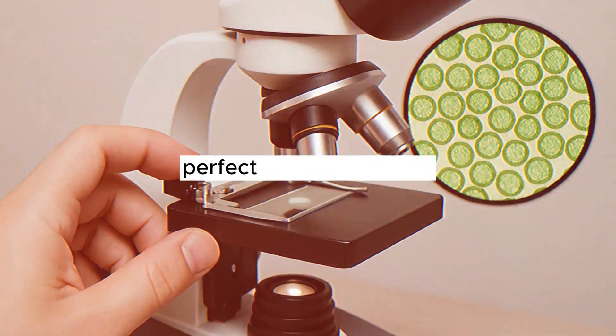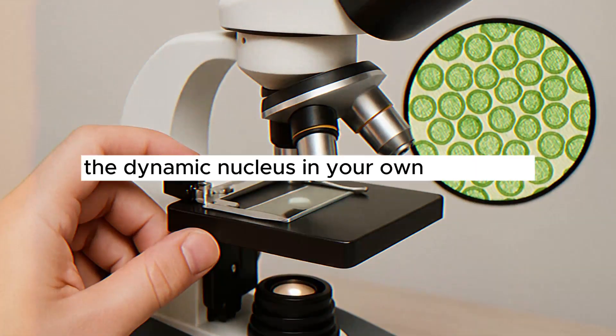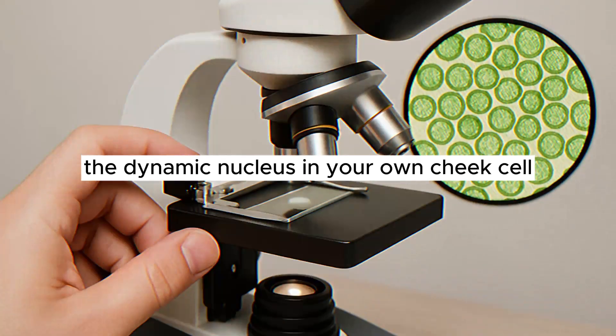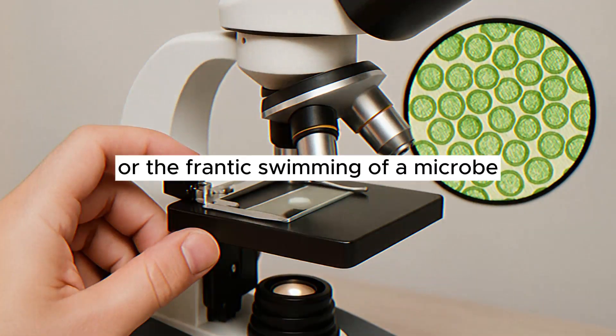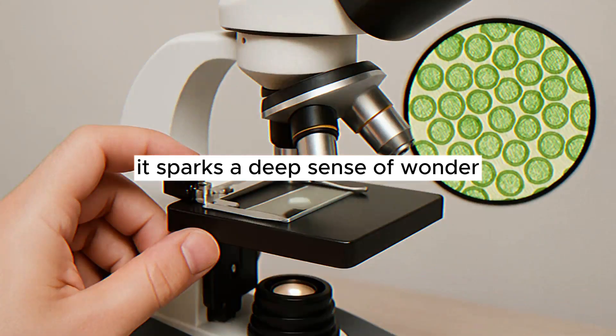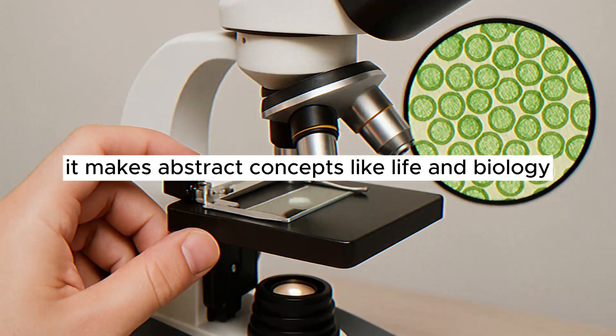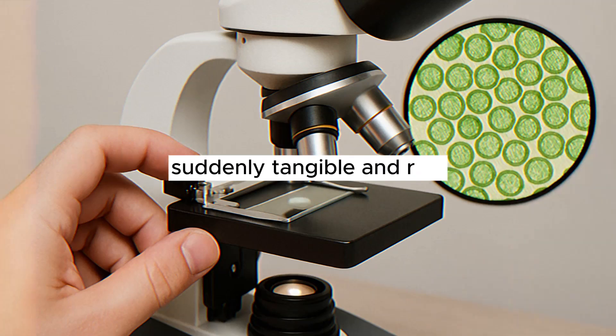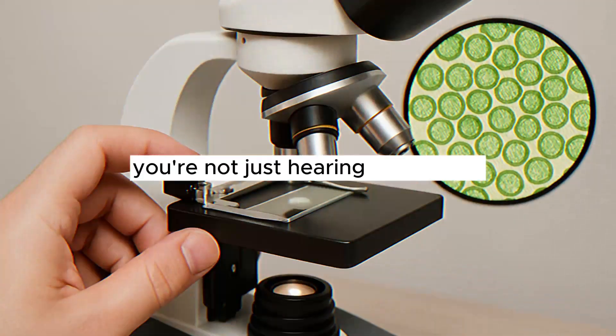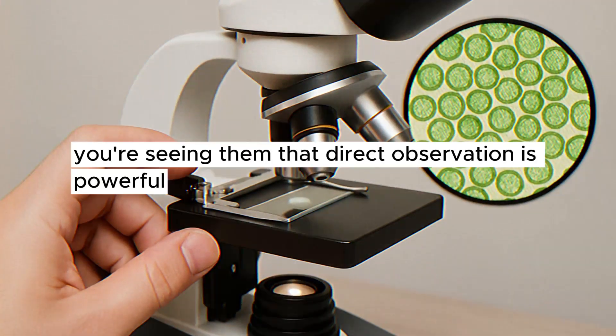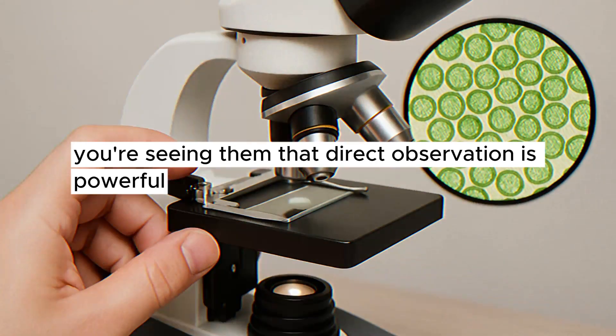Whether you're looking at the geometric perfection of a plant cell, the dynamic nucleus in your own cheek cell, or the frantic swimming of a microbe, it sparks a deep sense of wonder. It makes abstract concepts like life and biology suddenly tangible and real. You're not just hearing about cells, you're seeing them. That direct observation is powerful.